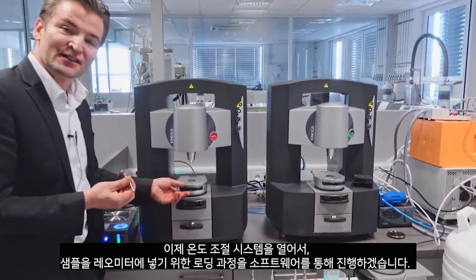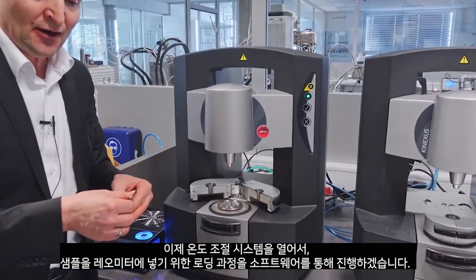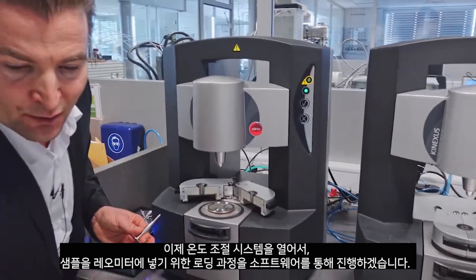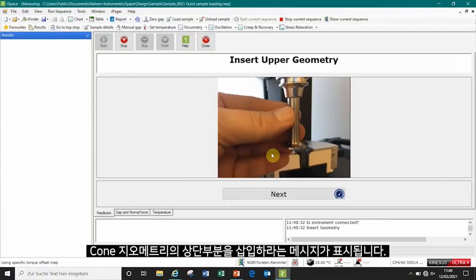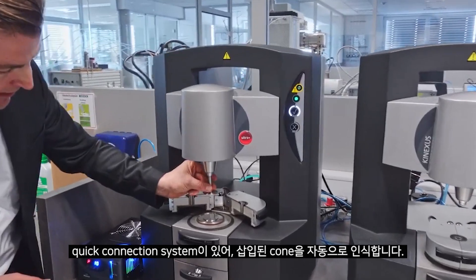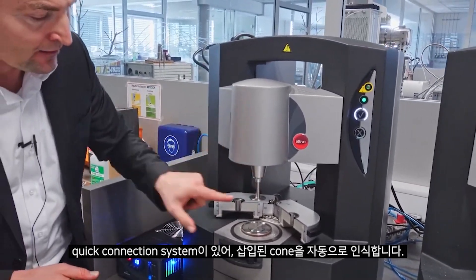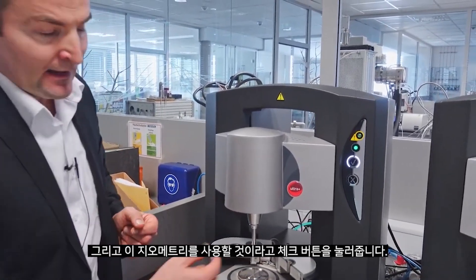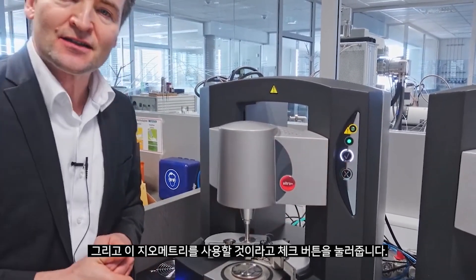Our temperature control system can be opened and now I will start the loading procedure in the software to bring the sample into the rheometer. We will be prompted to insert the upper cone, which is done by a quick connection system. The Kinexus reads automatically which cone is inserted and I will be prompted to confirm that I use this geometry.